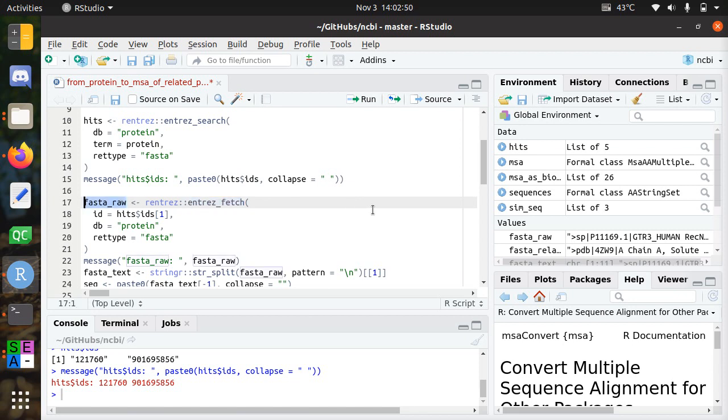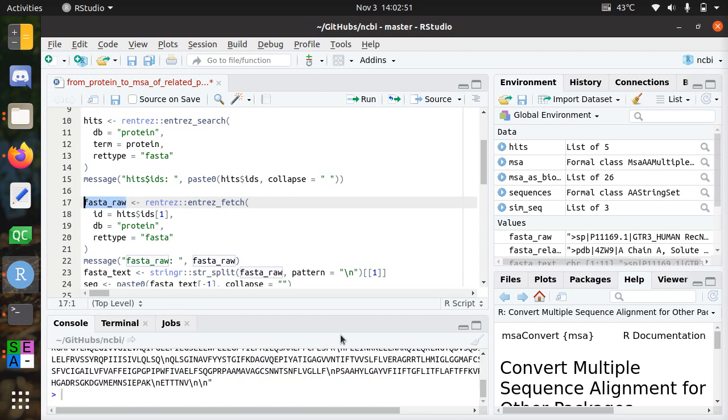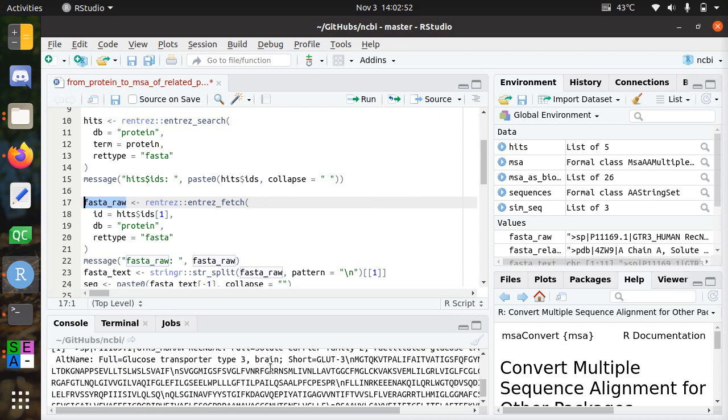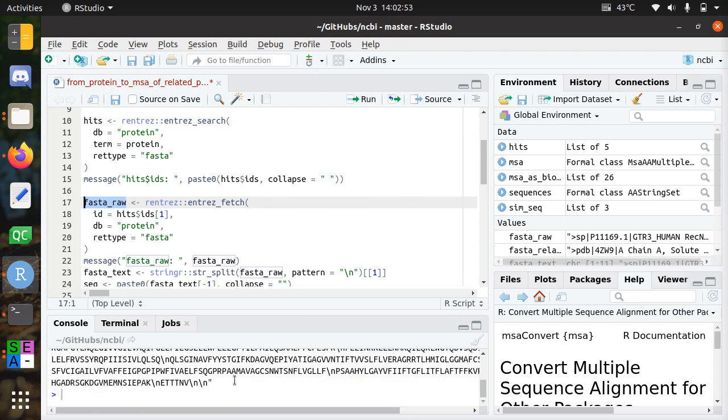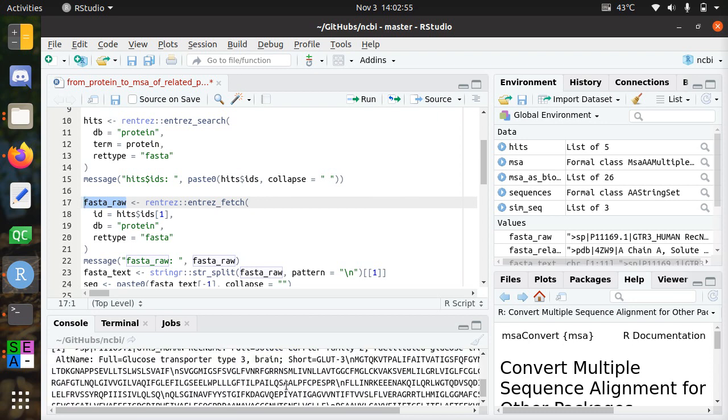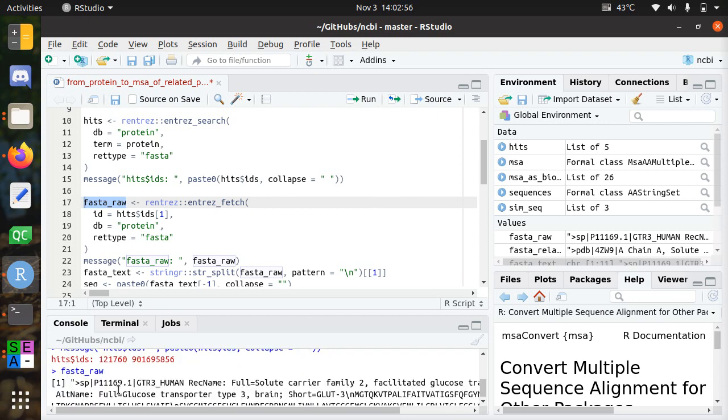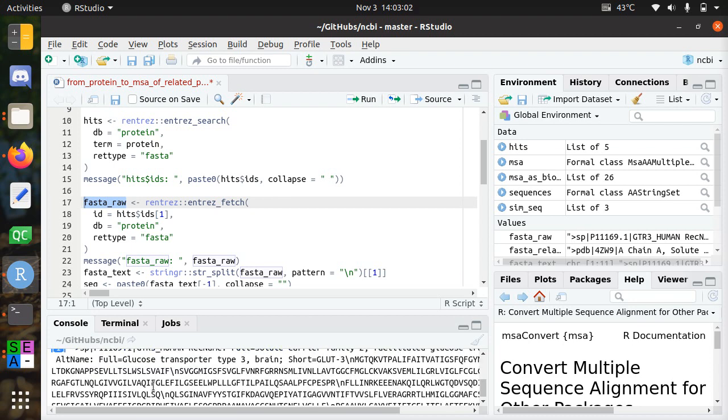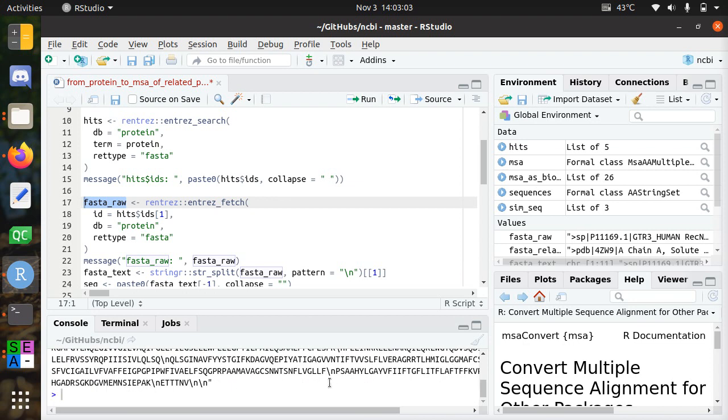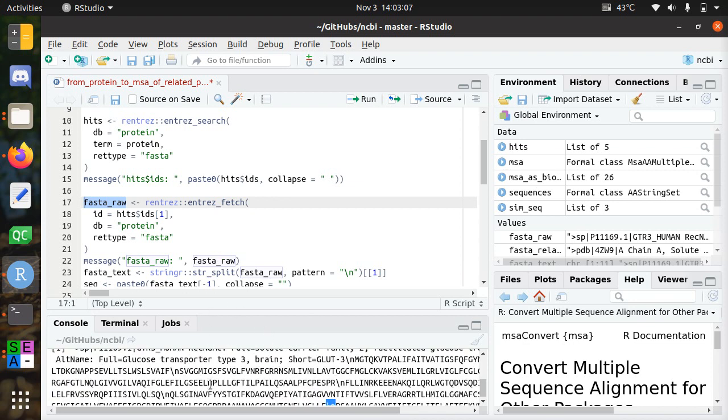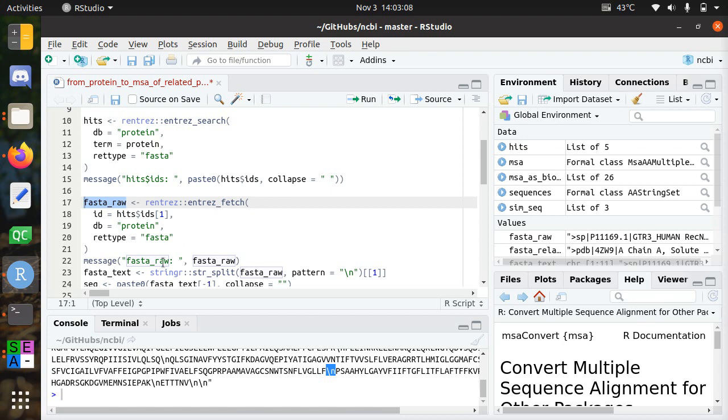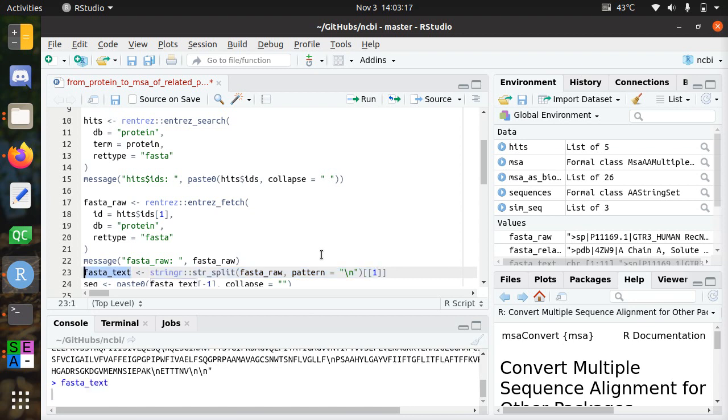So, this is how the sequence looks like. And you already see here that there are some new lines in it. So, it's one element. It's one character string. One character vector. A character vector length one. But it has new lines in it. So, that's not what we want in this case. So, what I did here. I split it again on the new line.